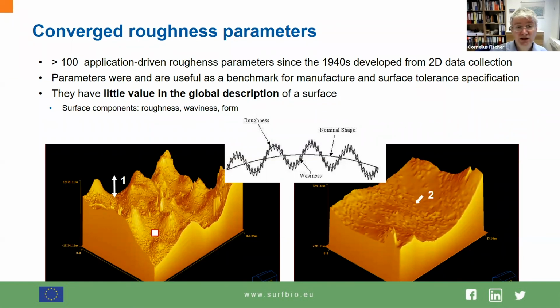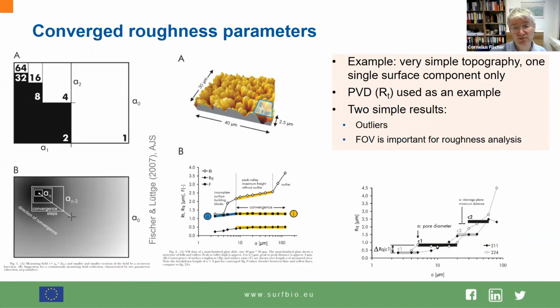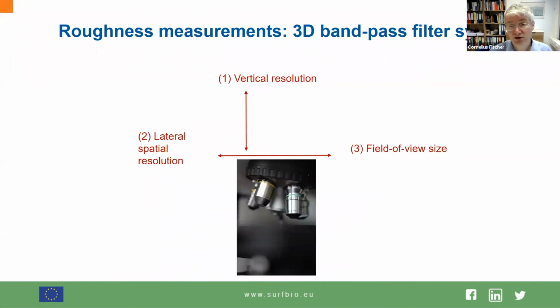and there might be no regular distribution of this kind of aberration. Then you have to do things manually and split your field of view size down to little subsections and compare whether or not you have a plateau situation of a surface roughness parameter. And if yes, then you can utilize your surface roughness parameter for comparison.